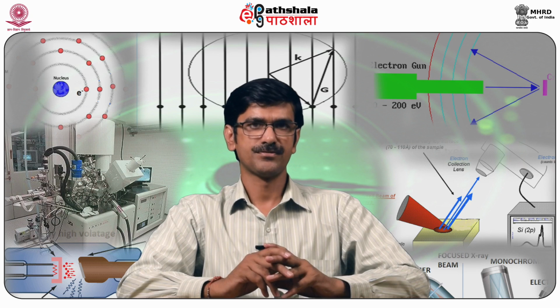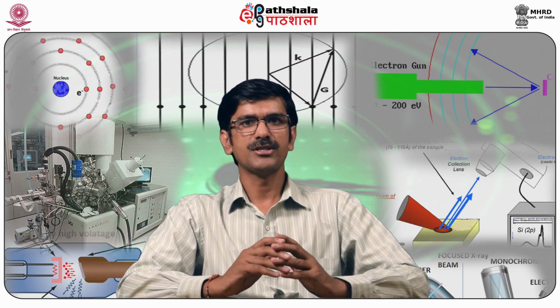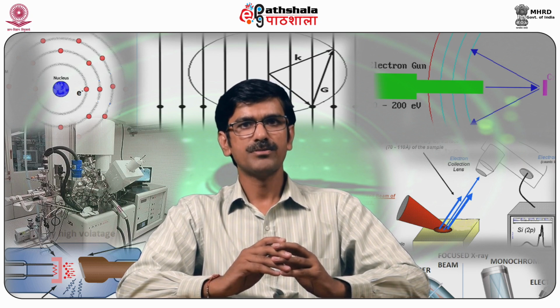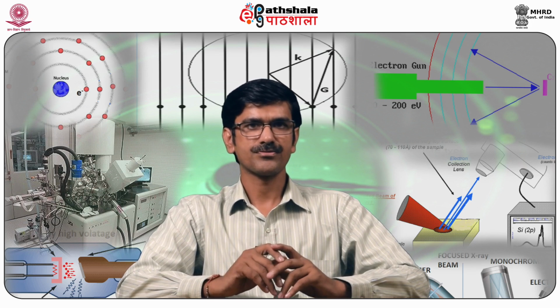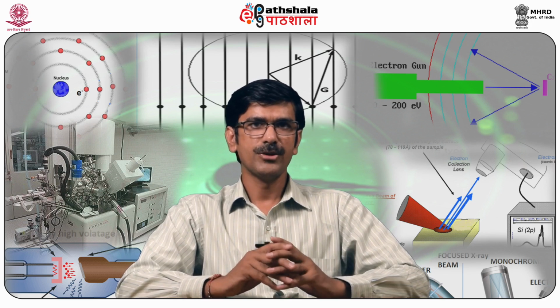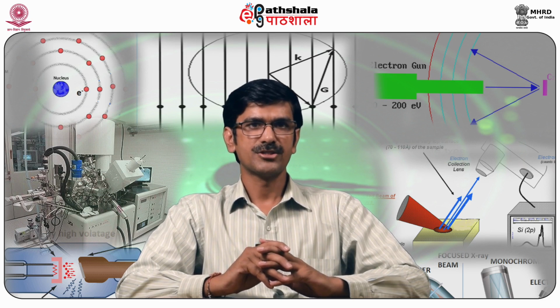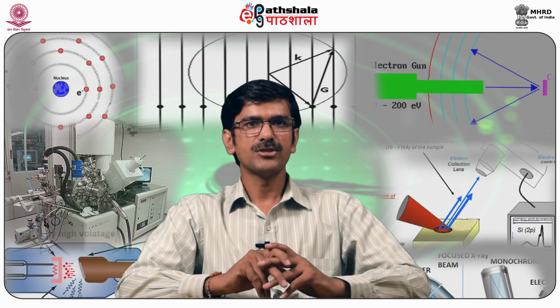Raman spectroscopy is best for symmetric vibrations in nonpolar groups, while IR spectroscopy is best suited for the asymmetric vibrations in polar groups. A complex molecule can absorb and emit energy when interacting with photons that can excite molecules to higher vibrational states. These quantized vibrations are called normal modes of vibrations of the molecule.